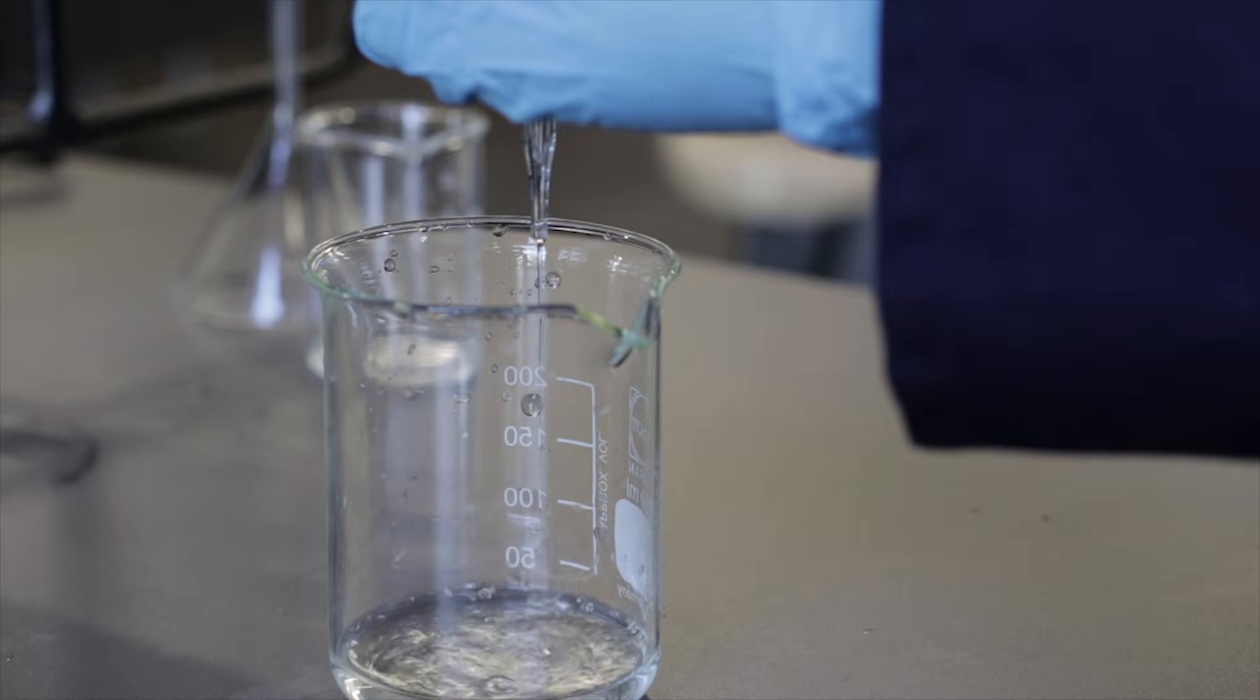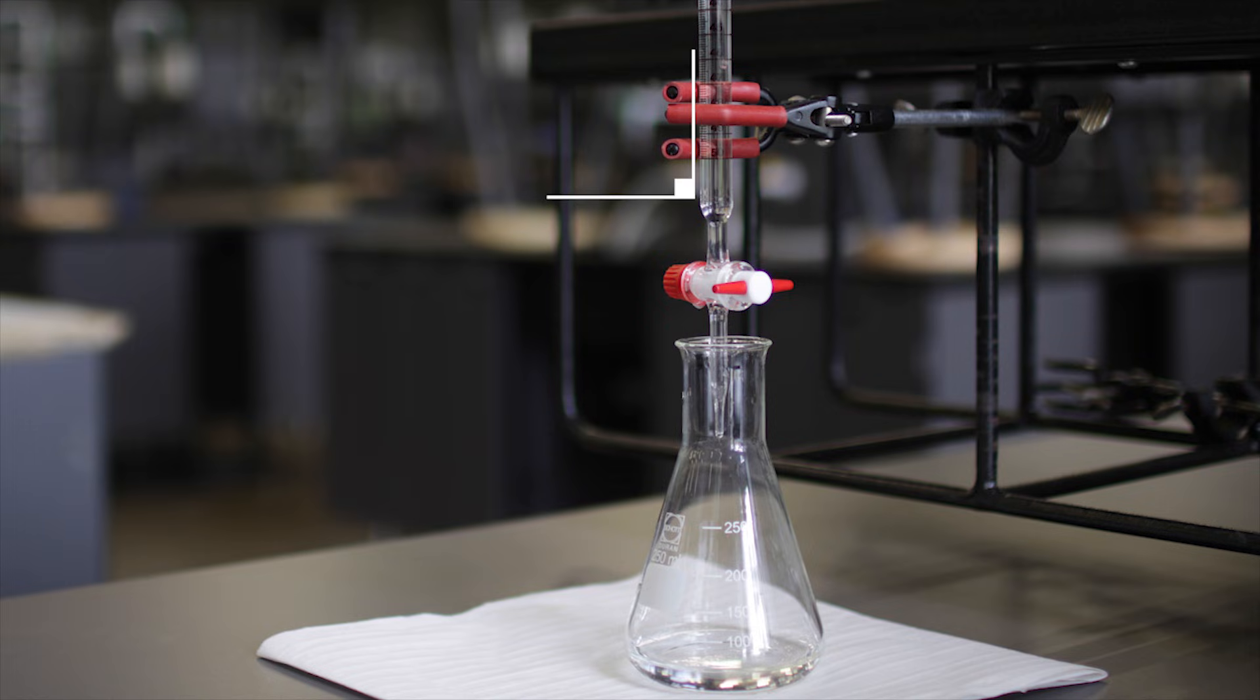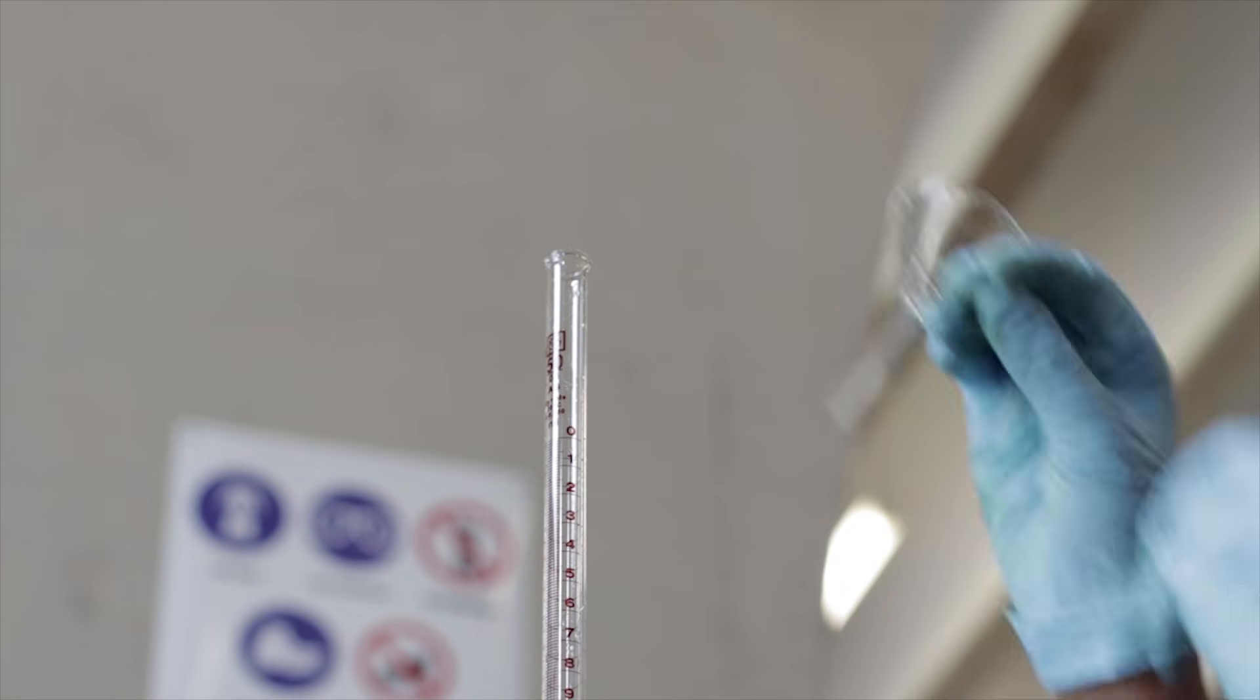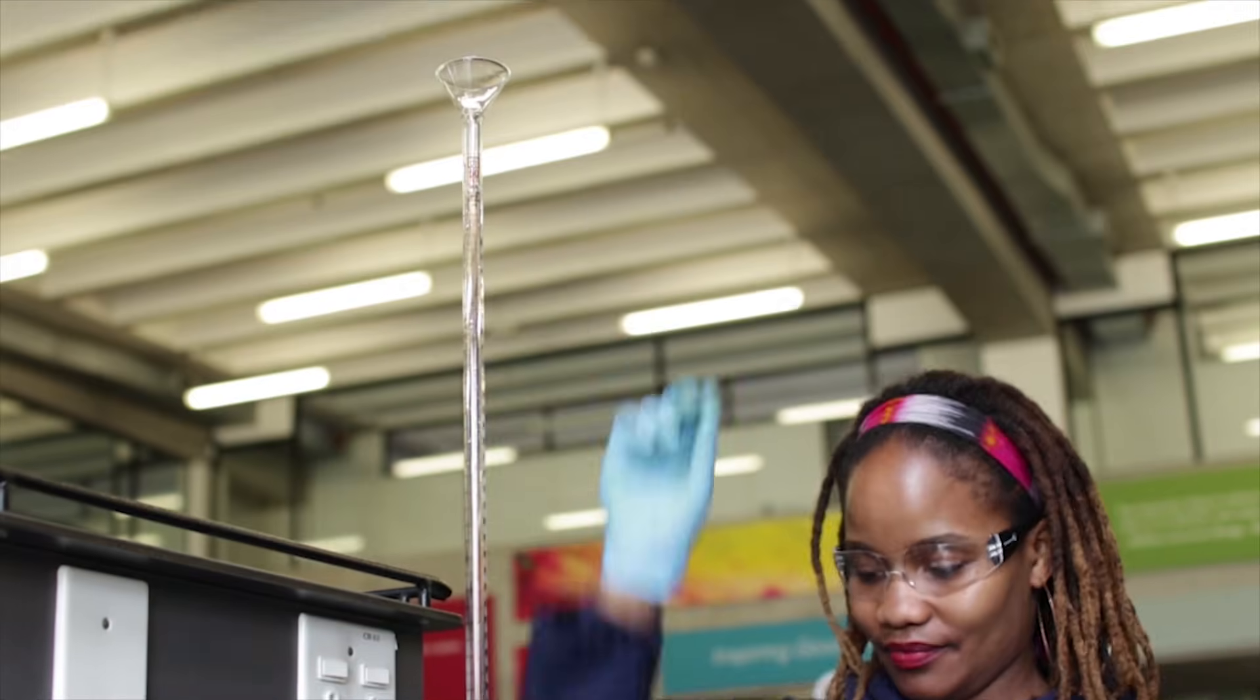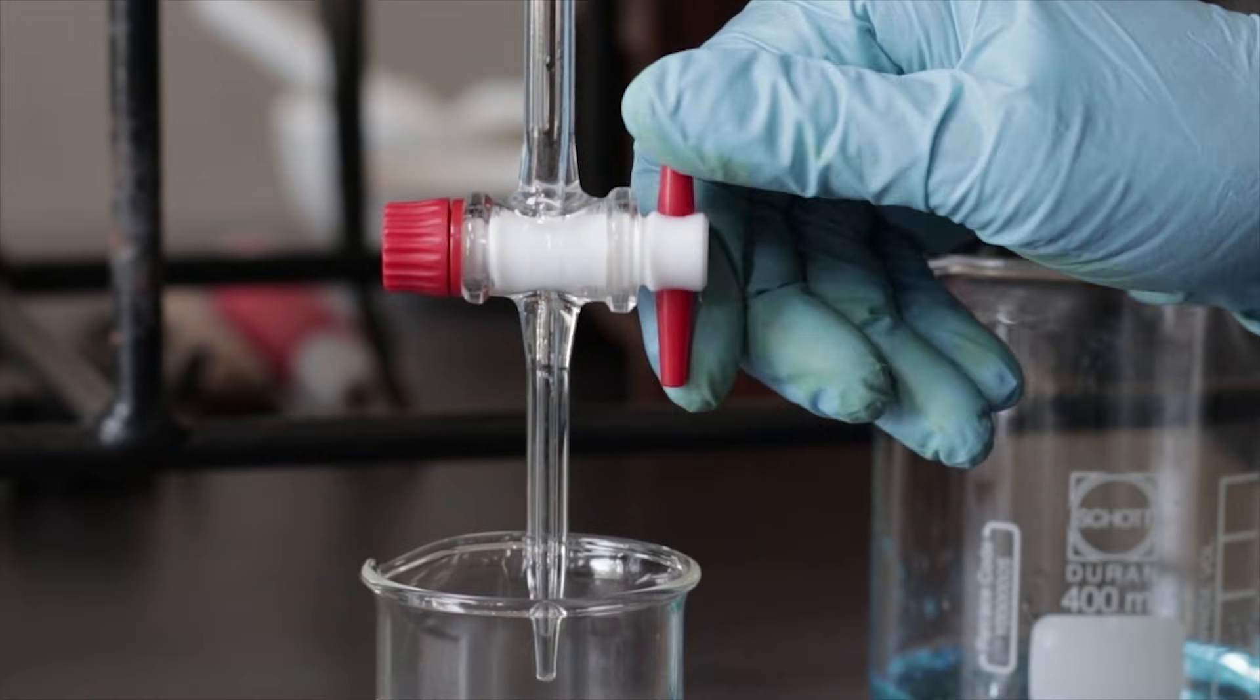After rinsing the burette it is clamped perpendicular to the bench stand. The funnel is then placed on top of the burette making sure the tap is closed.